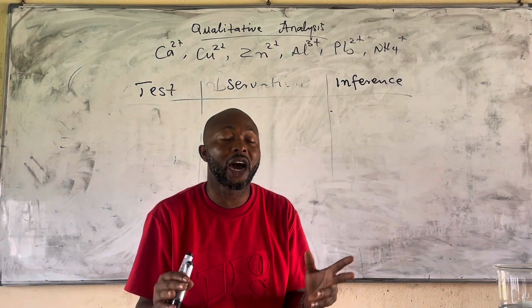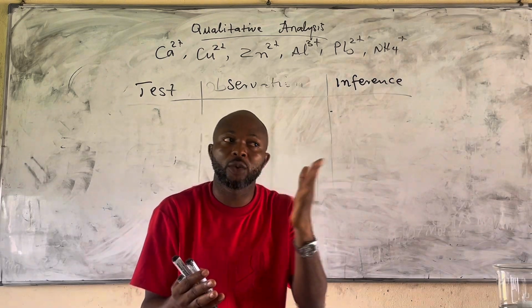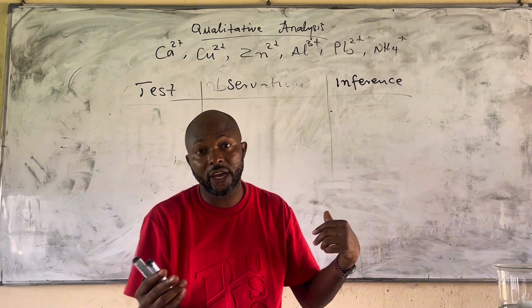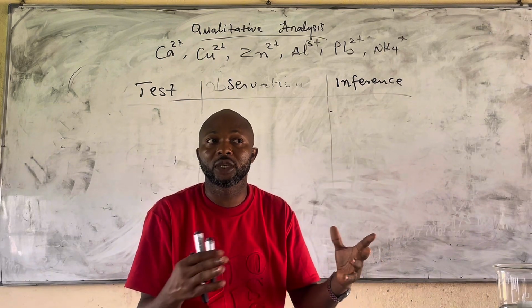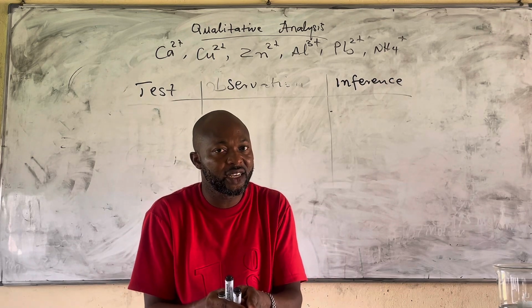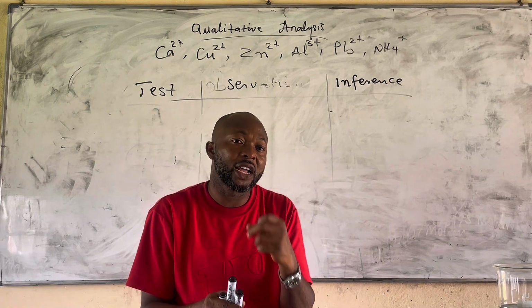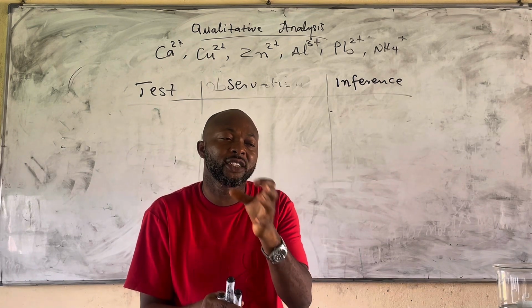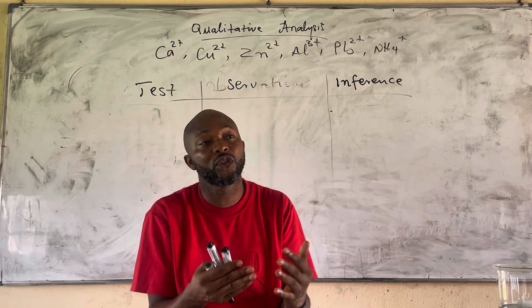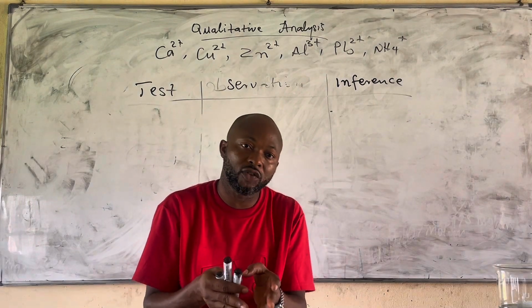They are insoluble. And calcium, there is no visible reaction with ammonia, but there was a dirty white precipitate with sodium hydroxide. And finally, to test ammonium salt, which is probably ammonium chloride, we said there was no reaction with sodium hydroxide, but on heating, a gas is given off which turns red litmus paper blue and has a pungent smell. And we say that gas is ammonia. We can still test that using concentrated HCl, which gives us dense white fumes with concentrated hydrochloric acid.